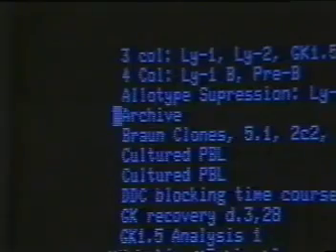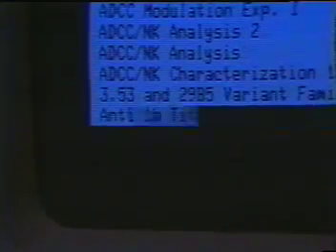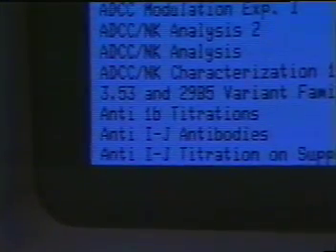To open the archive catalog, we place the cursor next to the word archive at desktop level, then give the down level command. This reveals the index level. Going down level into the author index reveals an alphabetical list of investigators. Using the flat commands, we position the cursor next to Kipps. Going down level to the lowest or card level reveals a separate white line for every analysis drawer that Tom Kipps has archived.